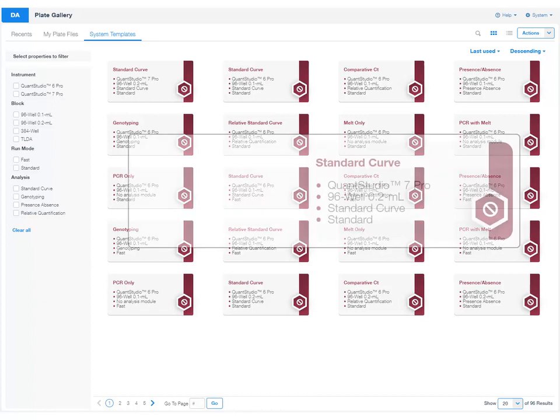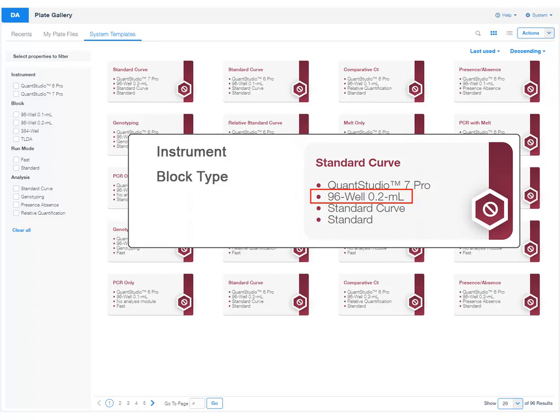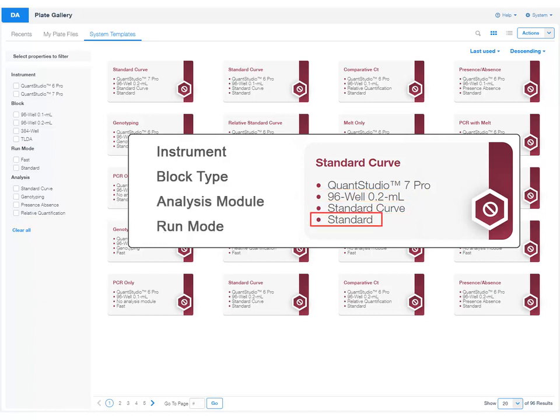Each system template corresponds to specific run properties, including instrument, block type, analysis module, and run mode. A system template cannot be edited, as indicated by the icon.